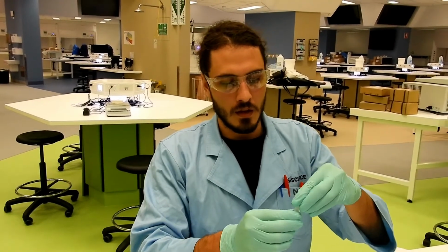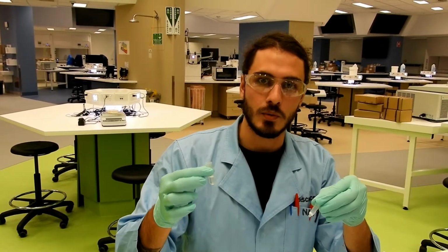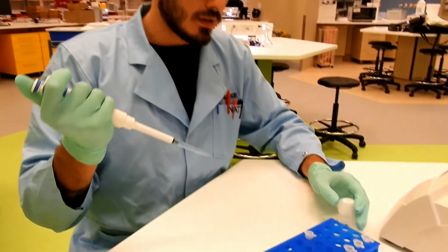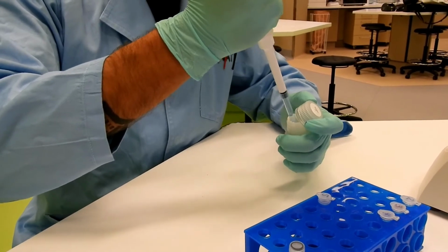The DNA has now selectively bound to the silica membrane on the filter. We can see the collection tube contains all the other contaminants, which we'll discard. Next, we'll wash the DNA using an ethanol solution. This solution will help remove residual salts and any other potential contaminants. We'll add 500 microliters of this solution to our sample.